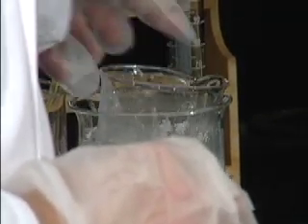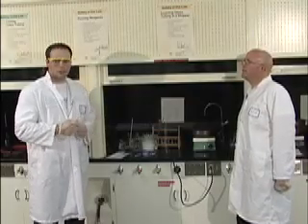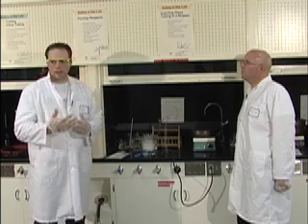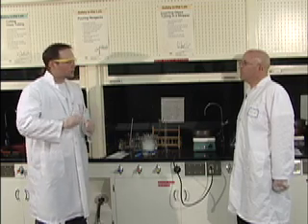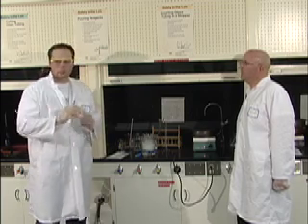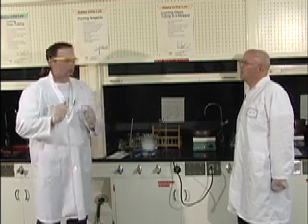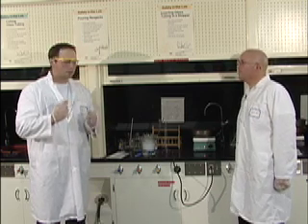It says in the lab that sometimes you need to start the crystal formation. Yeah, sometimes you'll need to seed the solution. How would I do that? You take a glass stir rod, and you simply scratch the surface of the beaker. Sometimes crystals need a surface to start crystallizing on. So if you scratch the side of the beaker, it gives them a surface to start crystallizing, and you'll notice that right away, bang, you have crystals. It's quite amazing, actually. Hopefully that'll happen to somebody. It's kind of cool.